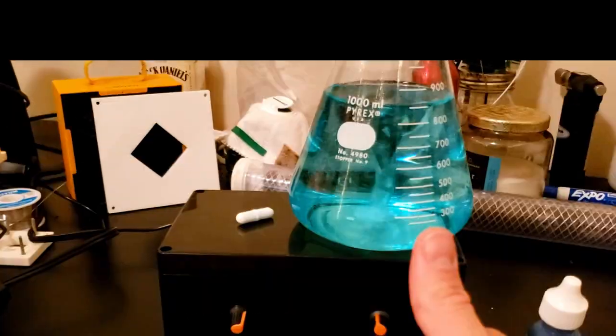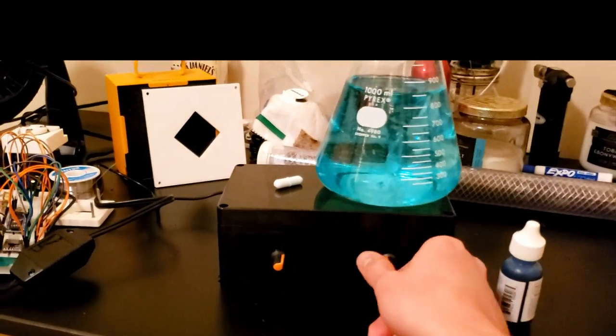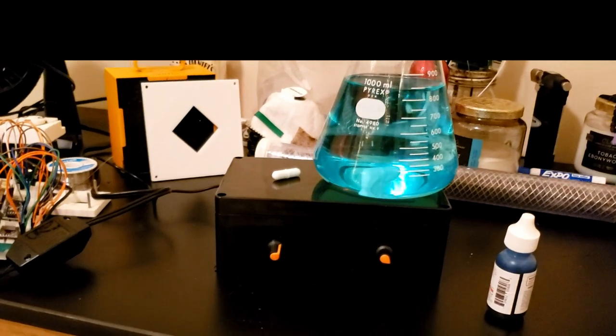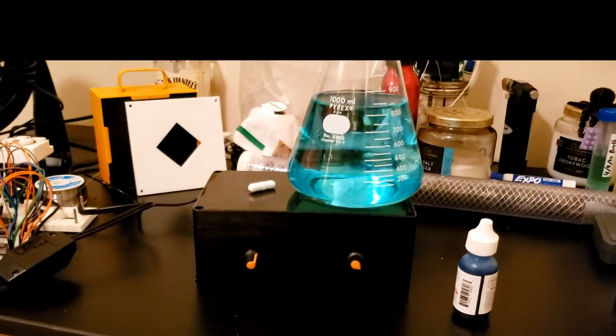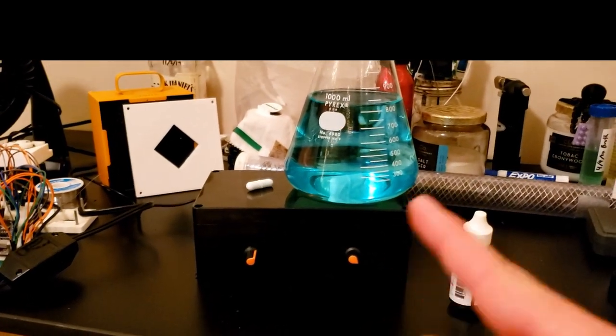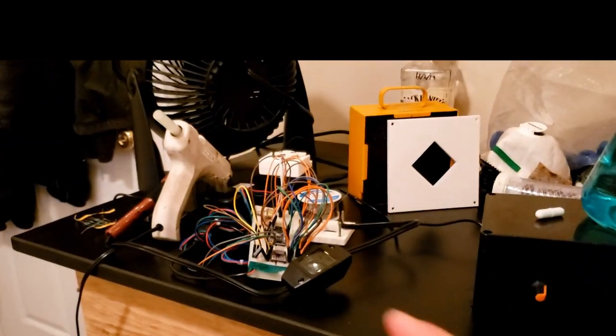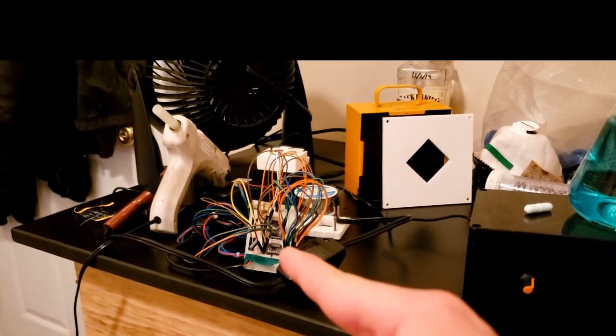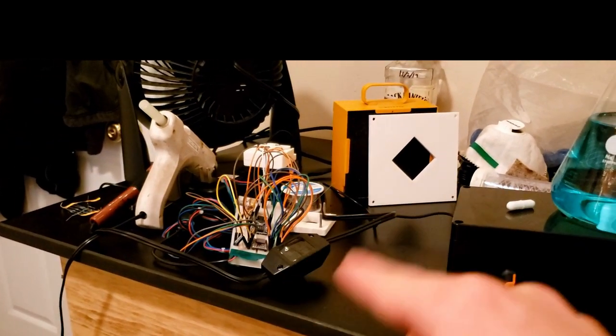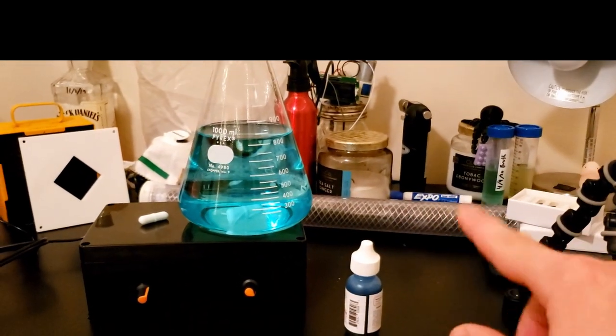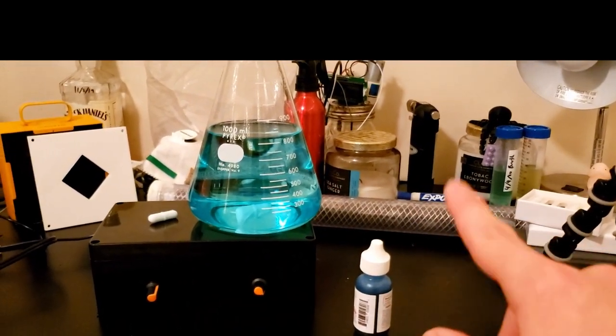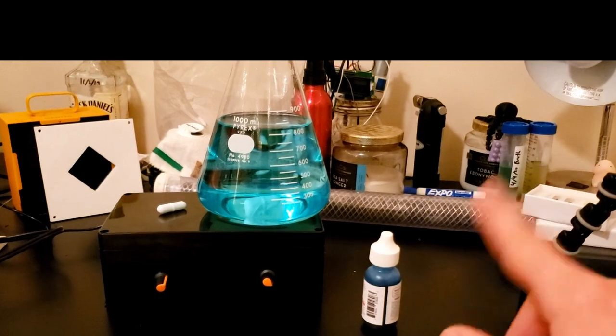That's it. I'm gonna use this to hopefully be incorporated into a do-it-yourself bioreactor kit. There's my peristaltic pump ready to be put in a box over there. There's a tubular fungi reactor right there. That's another video.